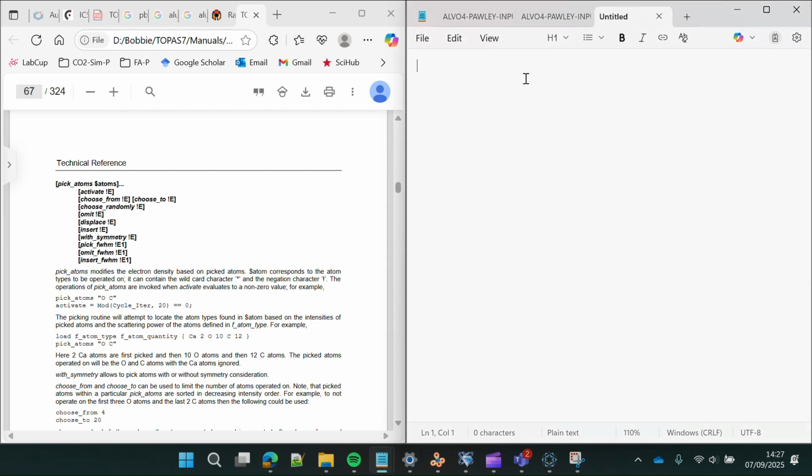So the first thing that we need is a section for the macros. And this is macro, and then we're just going to set this to, let's do 20,000 for now, and then we want the iteration number to also be 20,000 so that it will finish after one cycle.